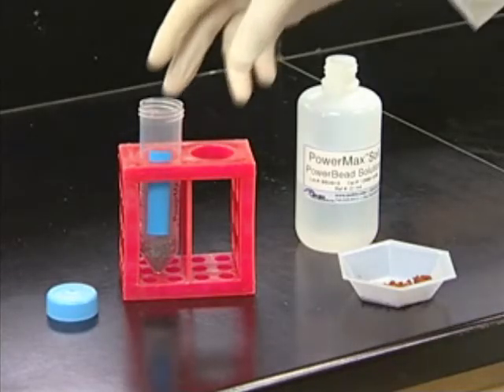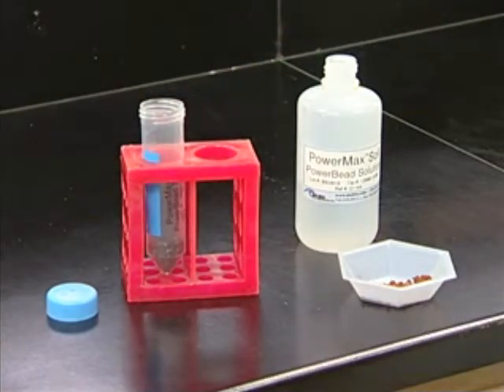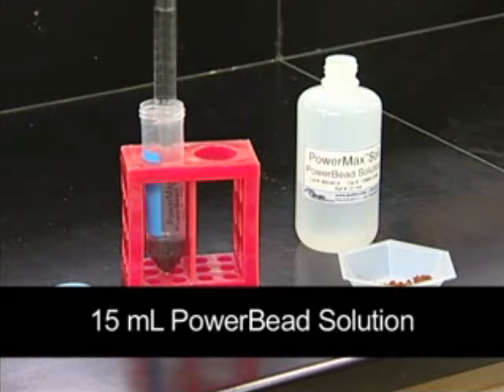Next, we need a power bead tube. Make sure it is not one of the normal tubes in the kit, as the extraction will not succeed if there are no beads present in this step. You should also be careful not to fill the tubes too full, or the efficiency of the extraction will be reduced significantly. Now, 15 milliliters of the power bead solution is added to one of the power bead tubes.